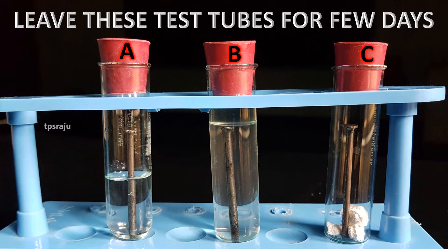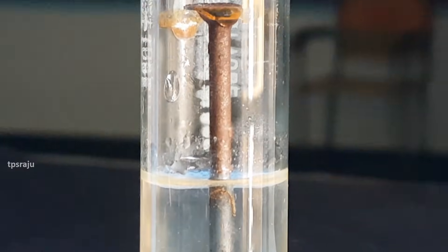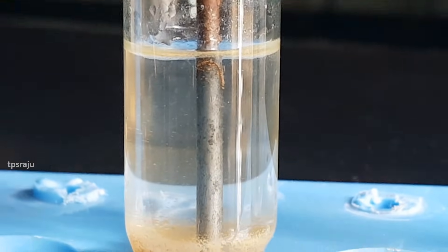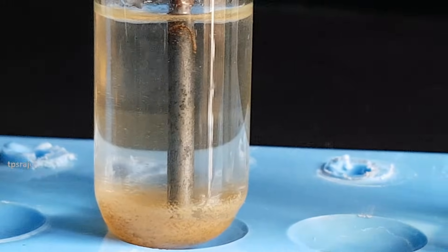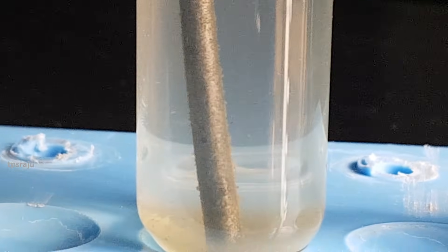Leave these test tubes for a few days. After a few days, the iron nail has rusted in test tube A, but does not rust in test tubes B and C.